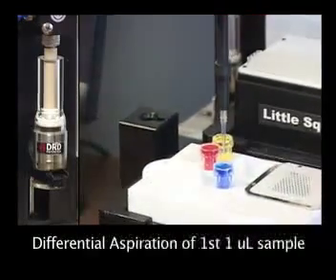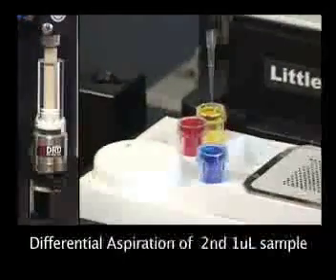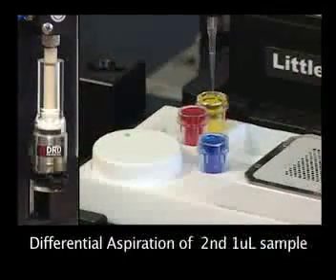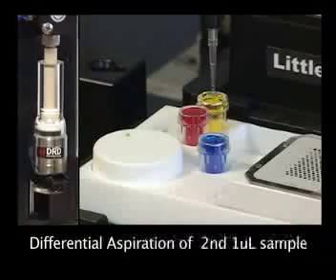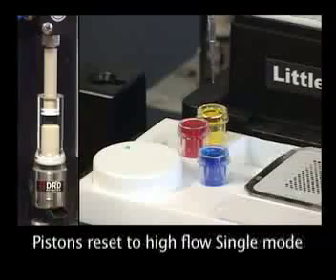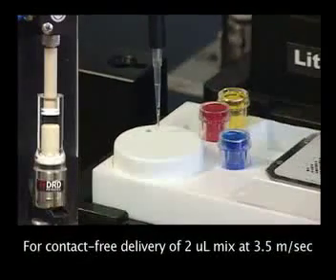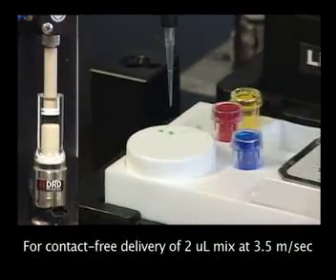Precise DRS differential aspiration of 1 µL, followed by precise differential aspiration of the second 1 µL sample. The DRS assembly then moves down to reset to high flow single mode for contact-free delivery at 3.5 meters per second.